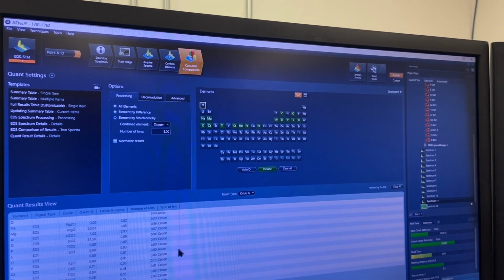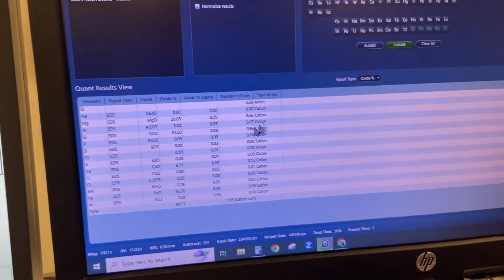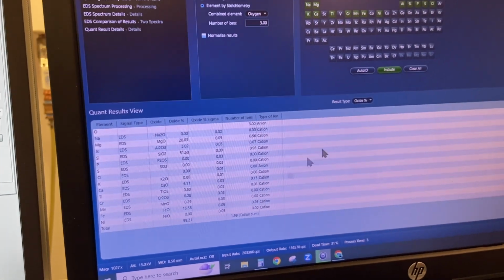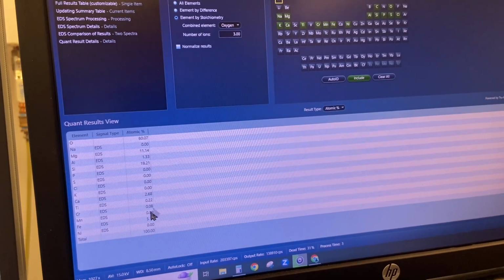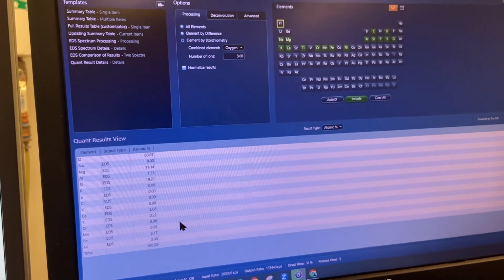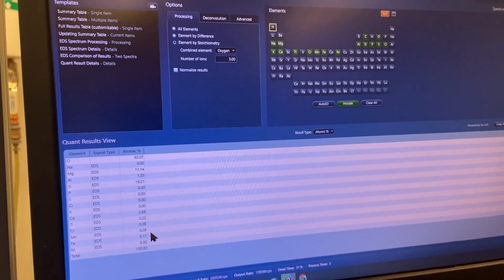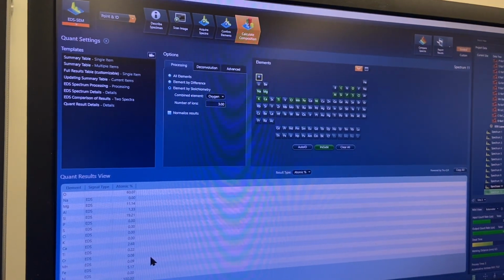So if you want to know what a pyroxene looks like, you're going to get some that's 1.9902 if you assume 3 oxygens. Good totals, right? I mean, these are pretty good. And then let's see if I do an iron manganese ratio, that's almost 50. That's very consistent with lunar pyroxenes. I could even do this in APFU, but I'm just doing the straight up ratio.